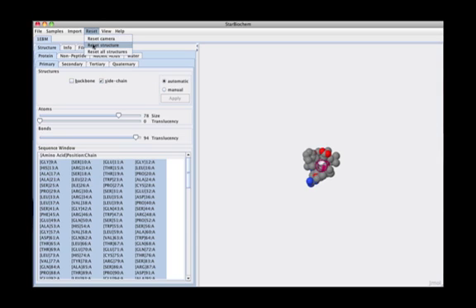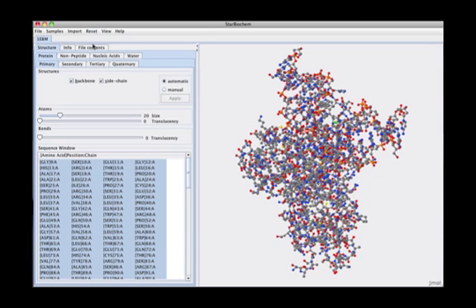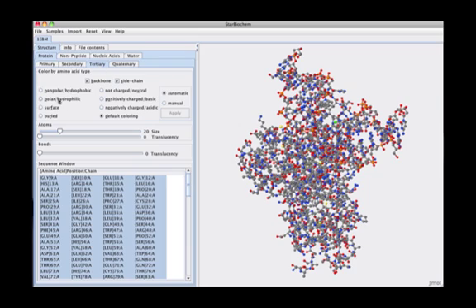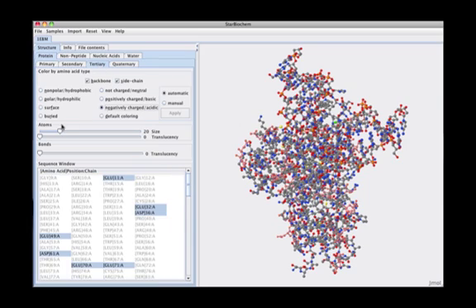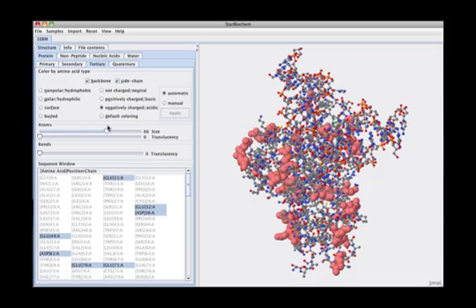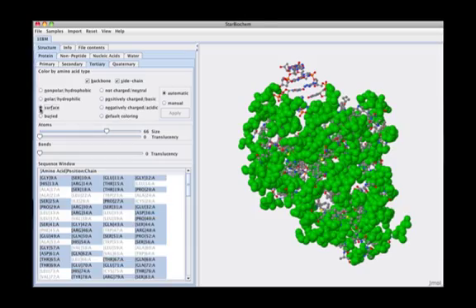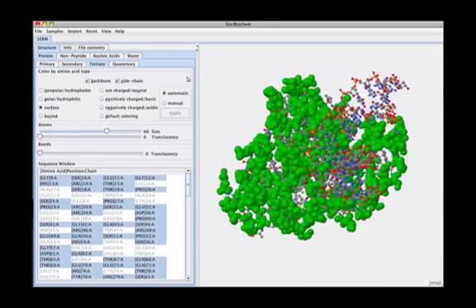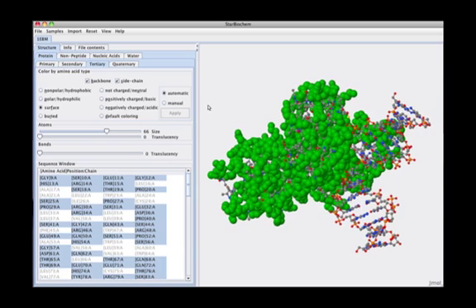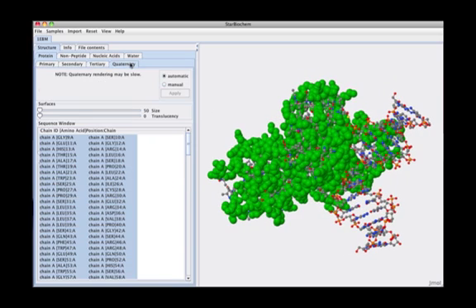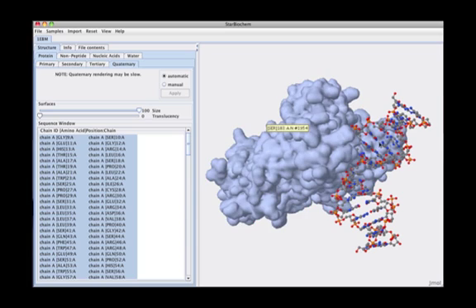The tertiary tab allows you to see how different amino acid types contribute to the structure, while the quaternary tab allows you to visualize the surfaces of each amino acid chain.